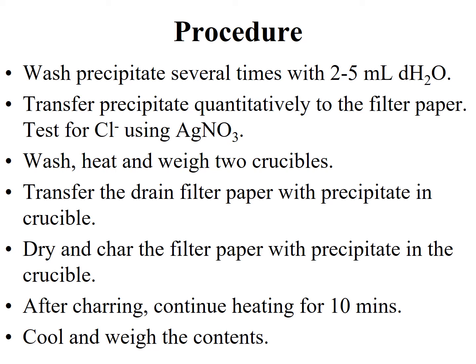Whenever you see a flame, immediately close the cover to smother the flames, and take care that complete combustion occurs. Your flame should be blue, not yellow, because you don't want the reducing gases swept back into the precipitate. When you have properly charred the paper completely, you remove the cover from the crucible and increase the heat gradually until the bottom of the crucible is a dull red.